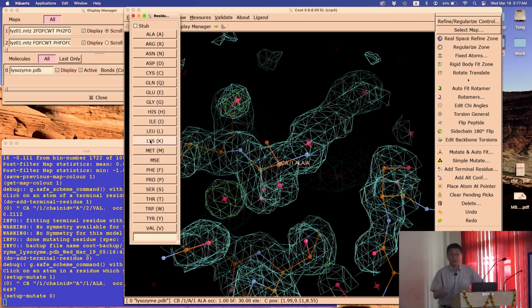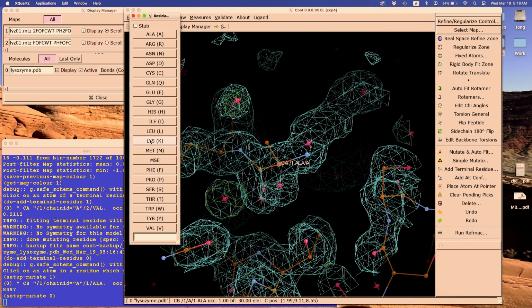I'll leave this up there for a little while. So do you know where we are, or where are you actually? Oh, you don't have the map yet. Okay. So open the map.